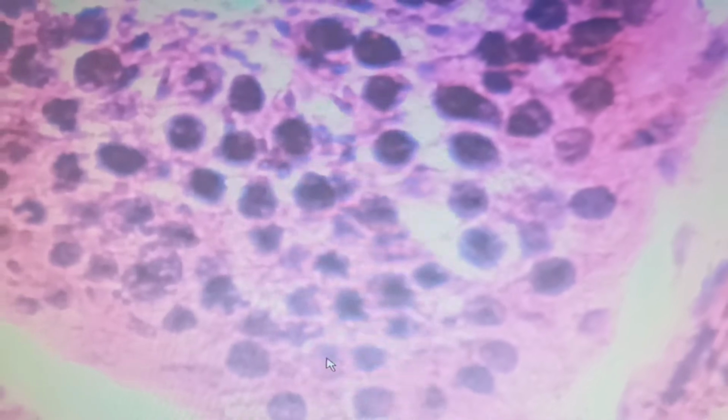You can see better under the microscope because we have a camera problem here. One of them is this cell, a light staining nucleus and prominent nucleolus. But the other cells, you can see they don't have the nucleolus. They have dark staining nuclei, spermatogenic lineage. But the Sertoli cells, like this one, have a light staining nucleus and prominent nucleolus. This way, we can recognize the Sertoli cells from the spermatogenic lineage.